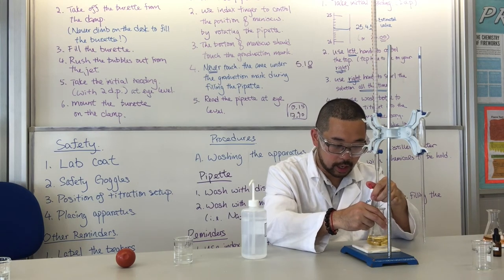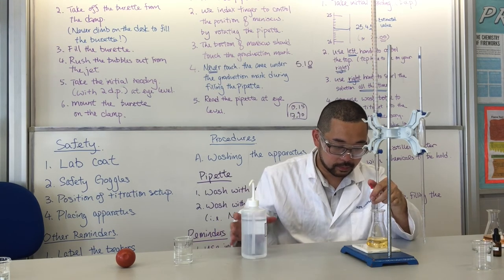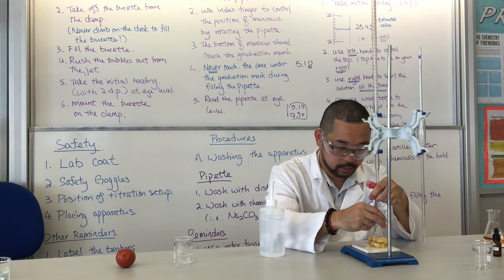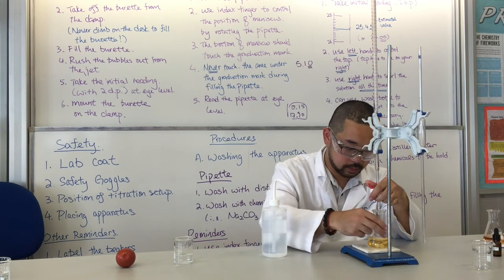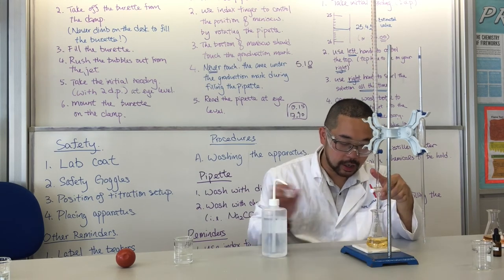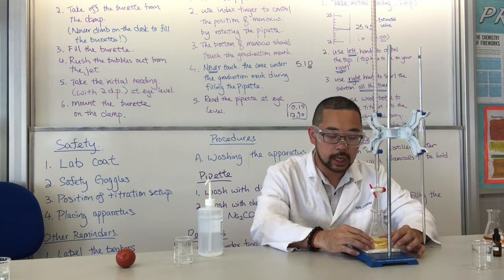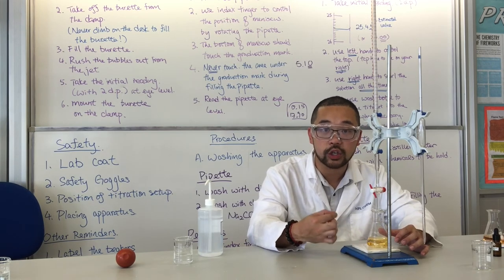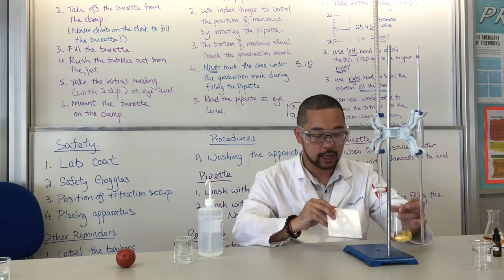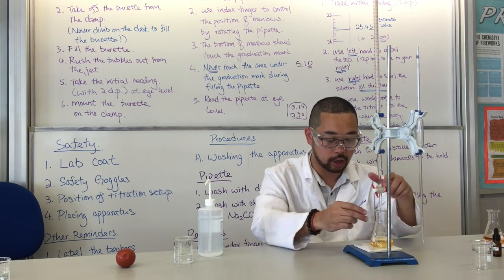So right now it's very close to the end point. We have to add very slowly into it. When you suspect this color is very close to orange, I would suggest you first take the reading, because sometimes it will be very sensitive, and another drop may make it turn into pink. So this one is slightly close to orange color, if you can see. Next, we try to add another drop, to see whether it will turn into pink or not, or give a better color.